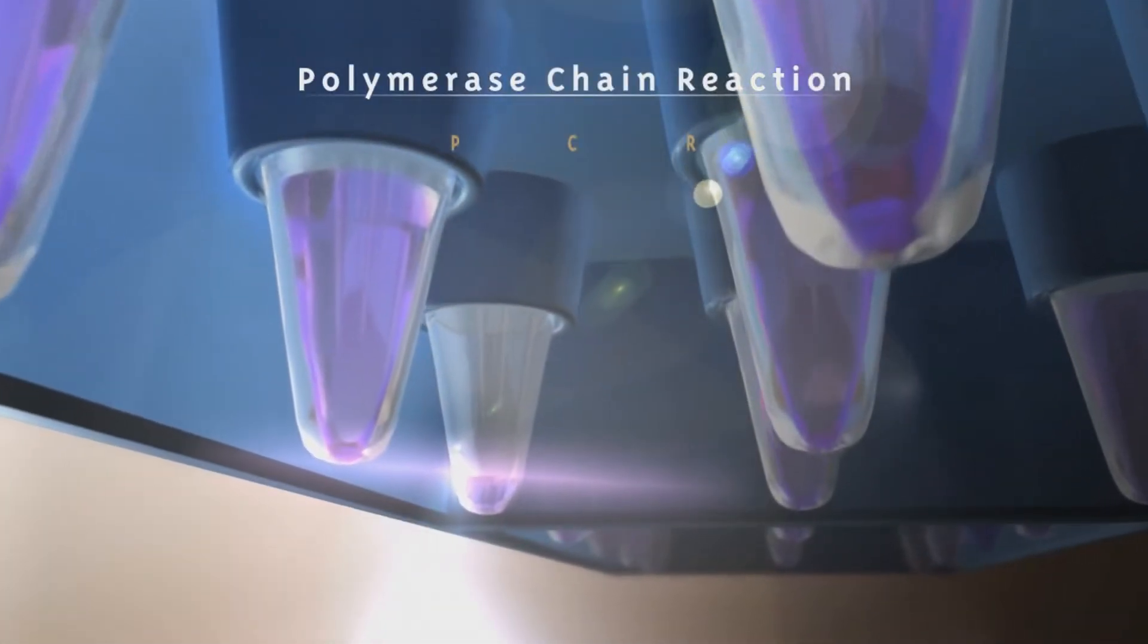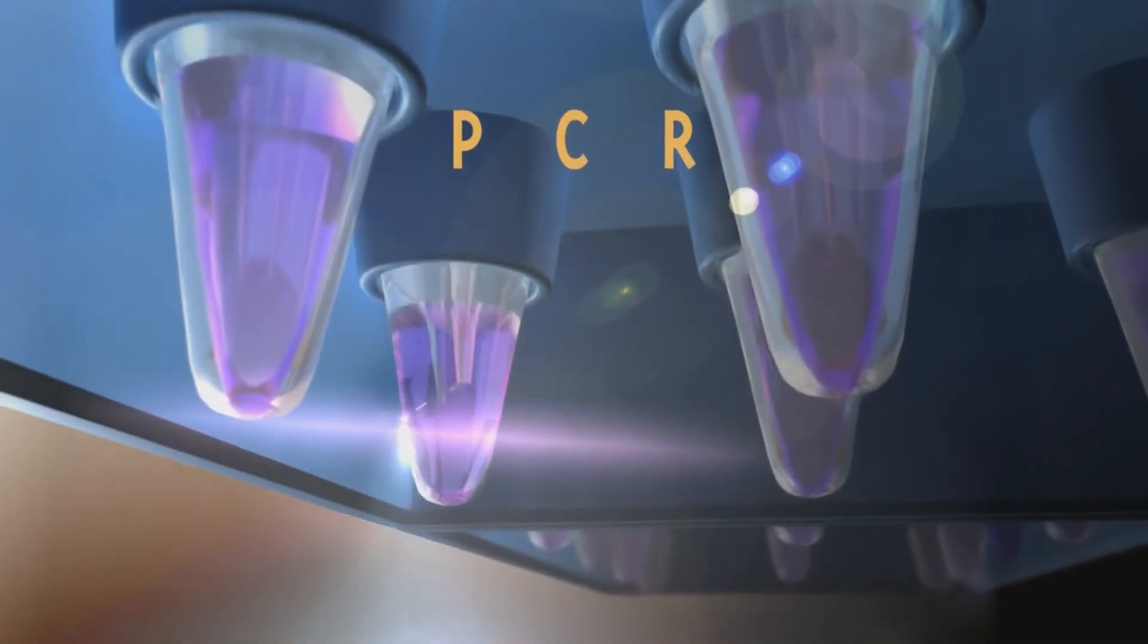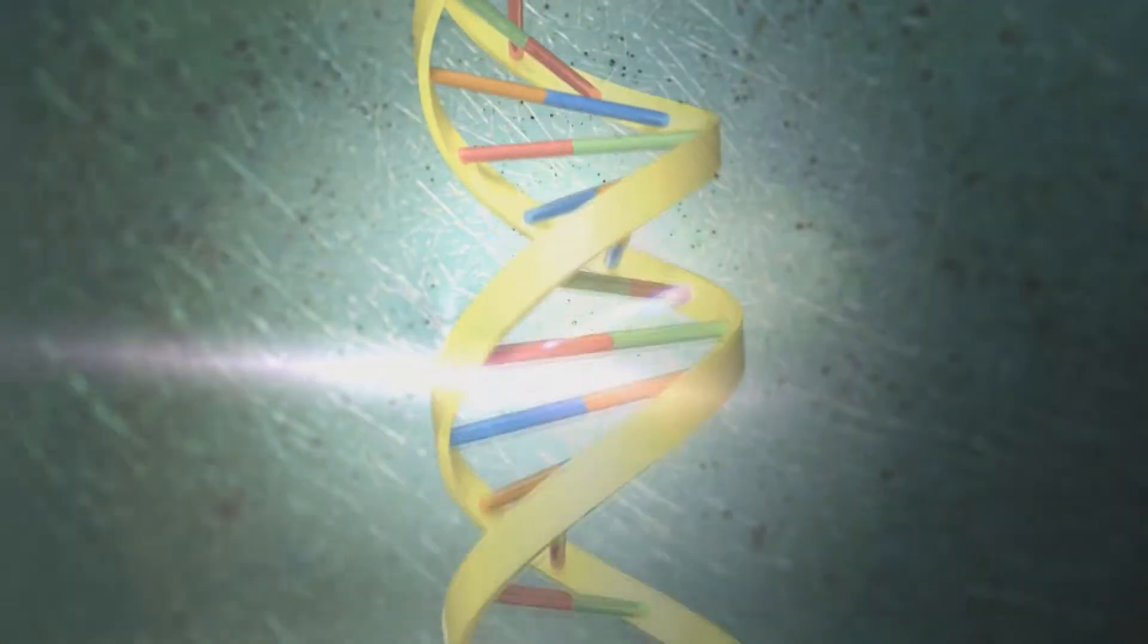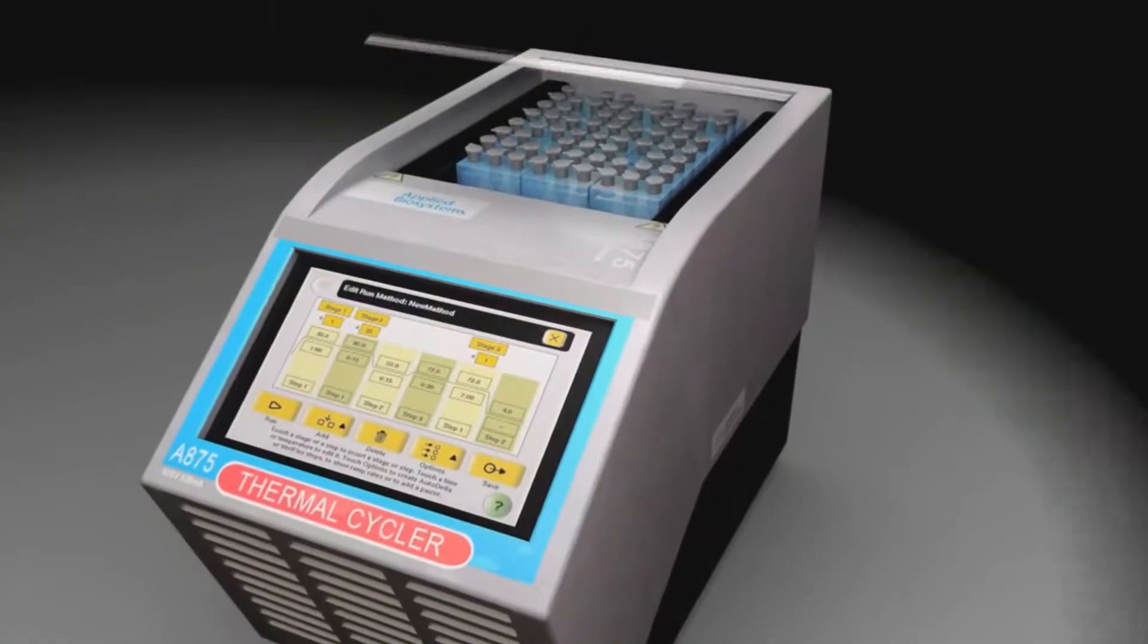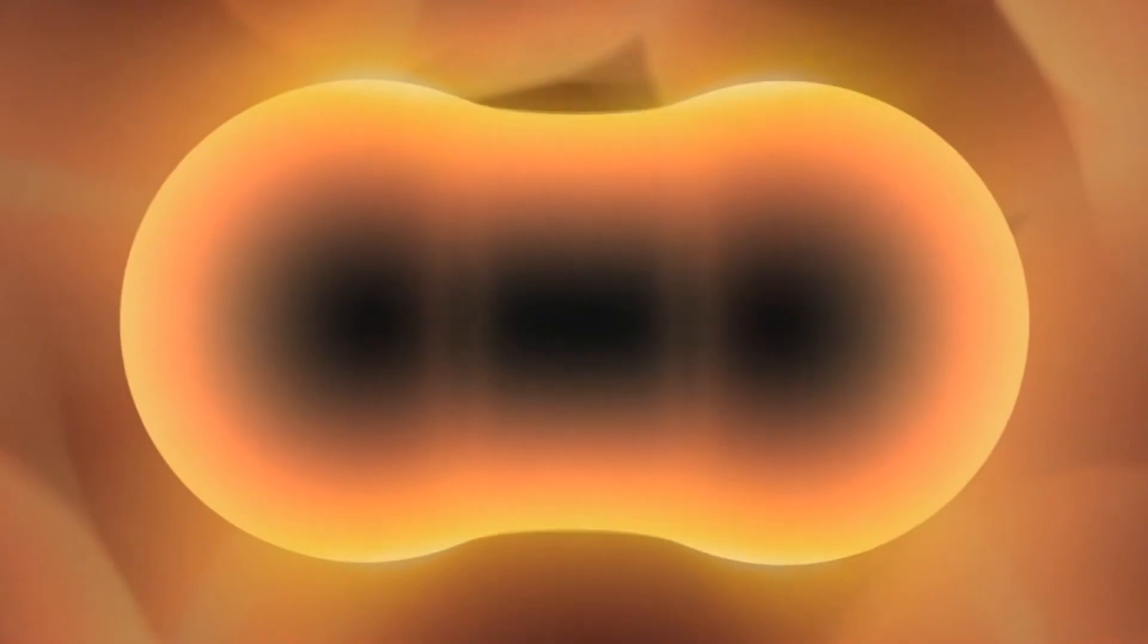Polymerase Chain Reaction, or PCR, is a simple yet essential way to make copies of a small amount of DNA by exploiting DNA's natural ability to replicate itself when a cell divides.